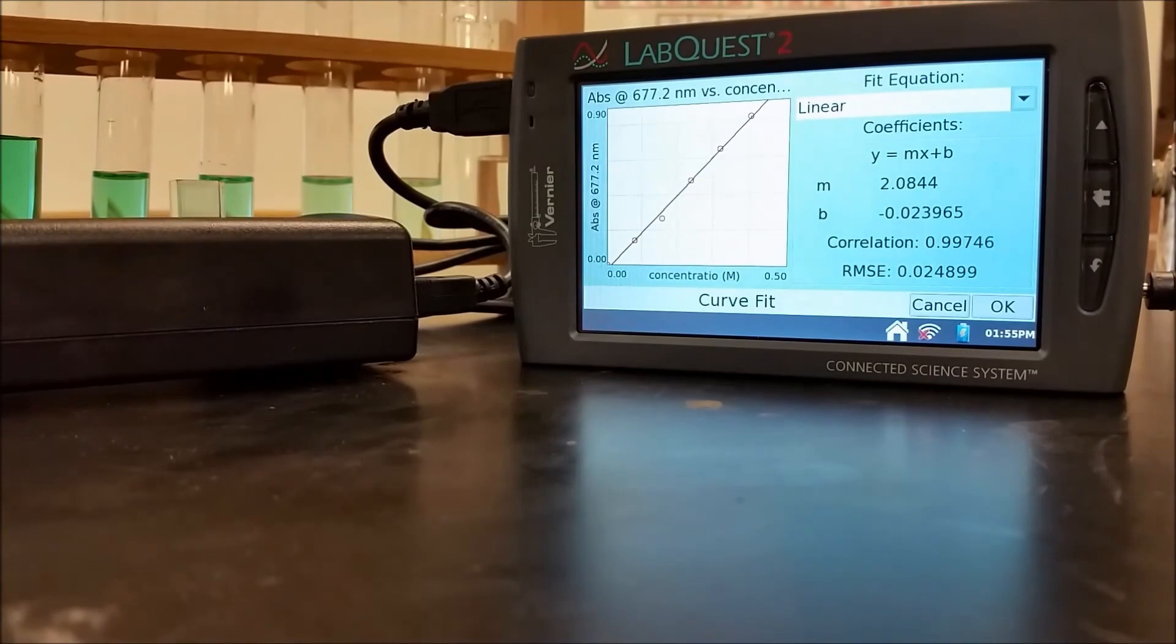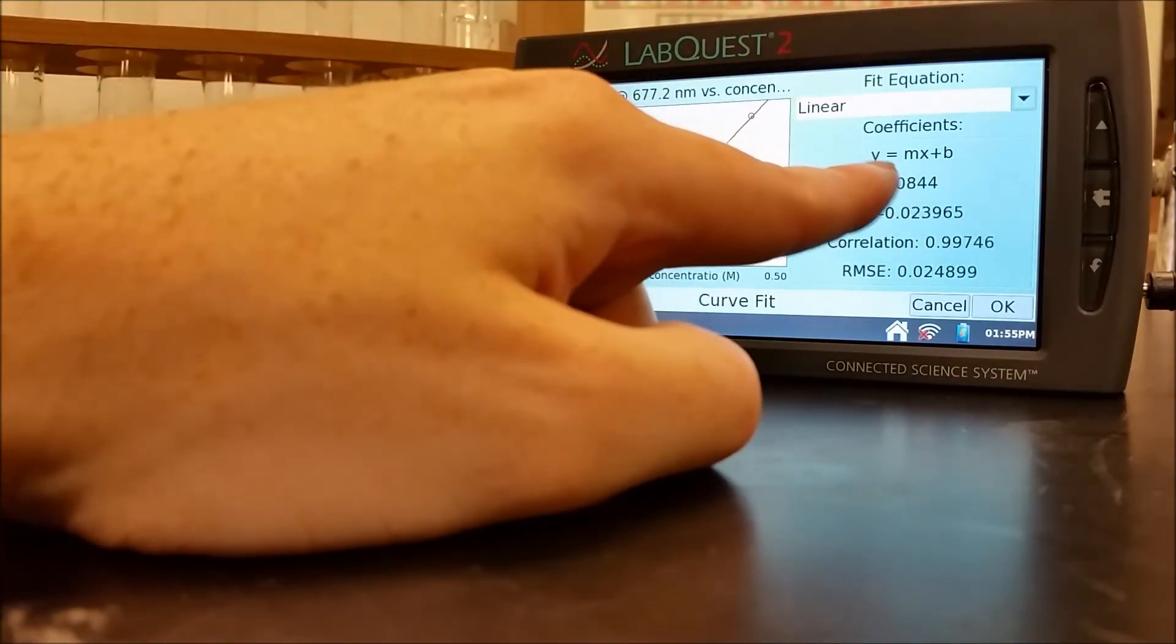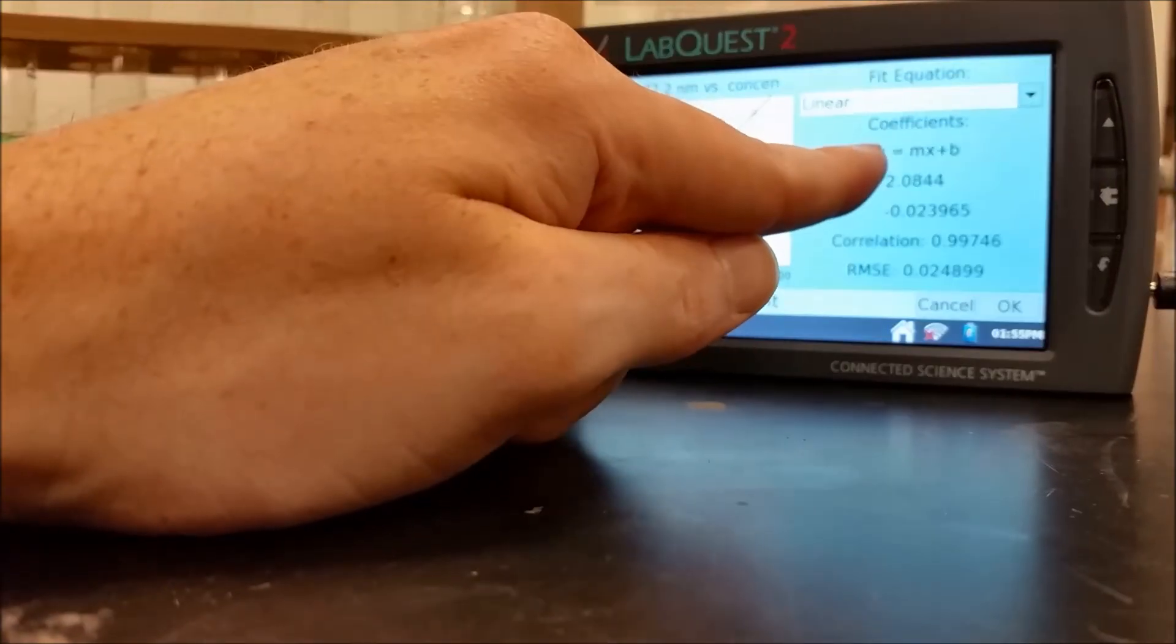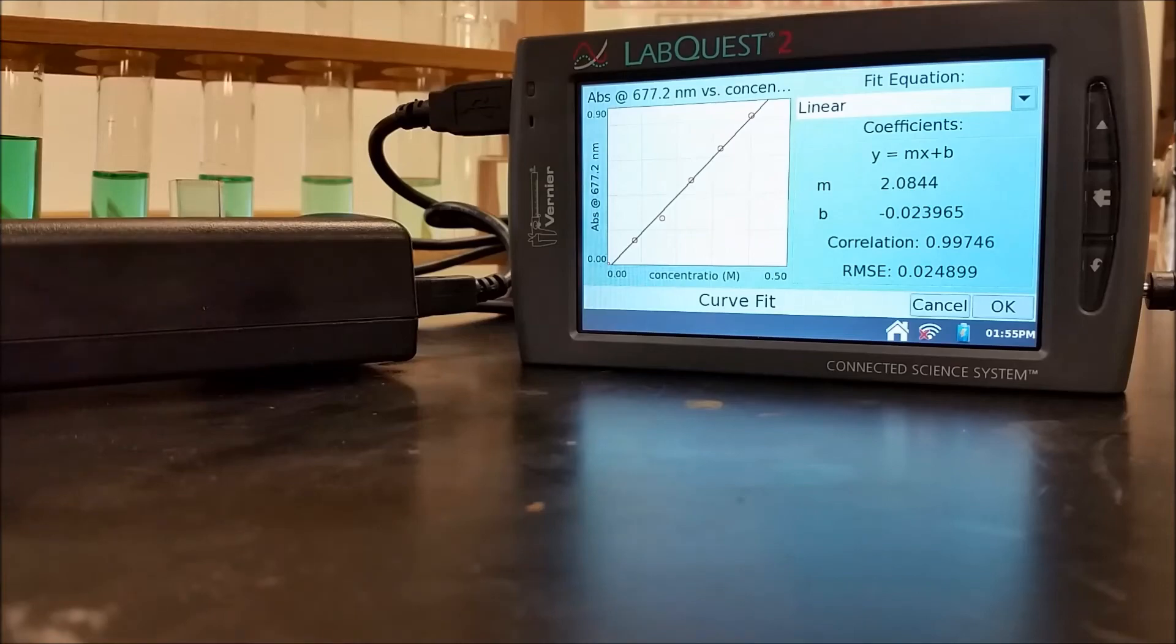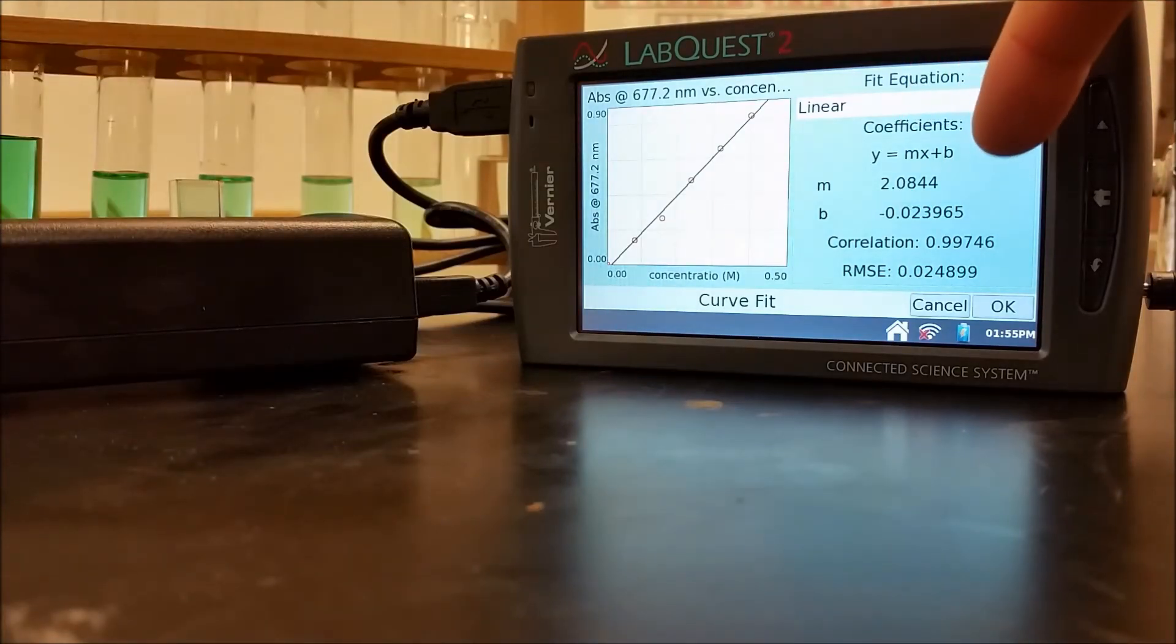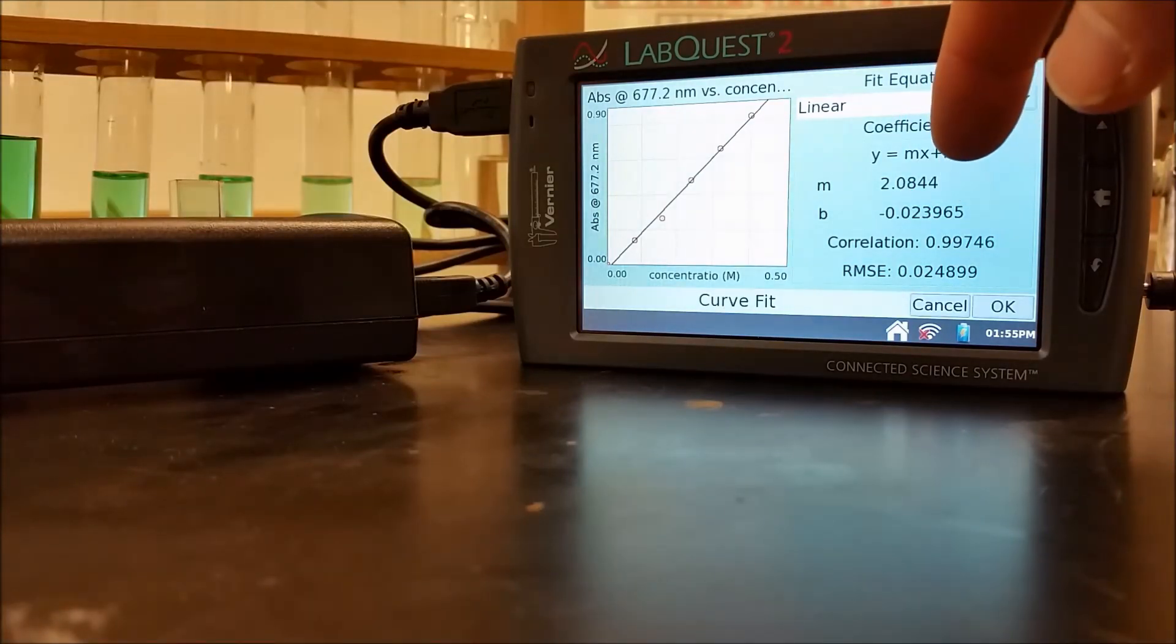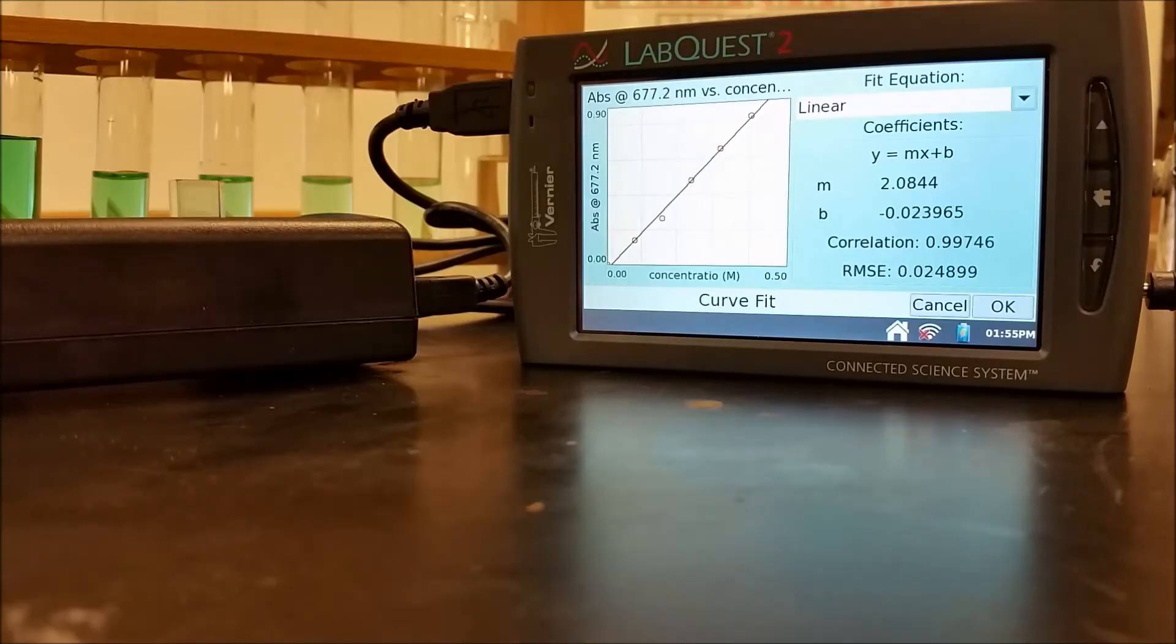So that's my calibration curve. What I can then do is I can find the absorbance of my unknown for y and then plug that in and then divide by the slope value and get rid of the intercept value. And then solve for x, which would be my concentration. So I'm going to do that now.